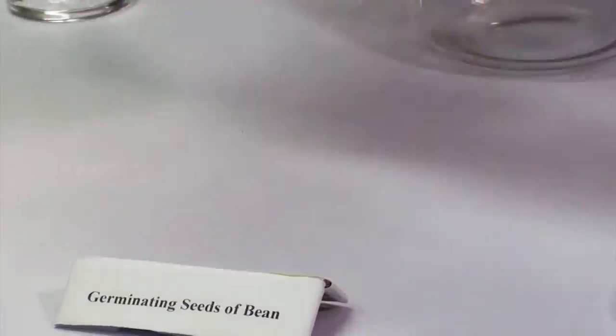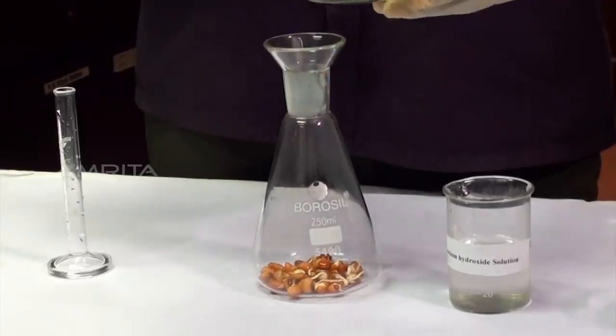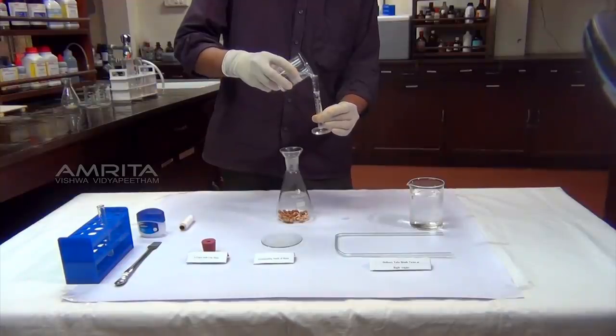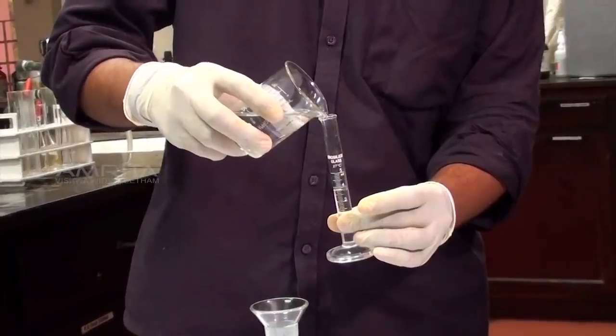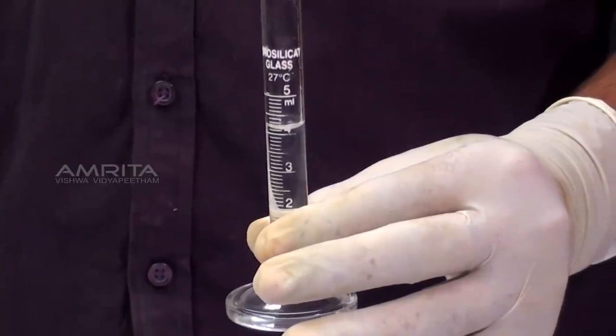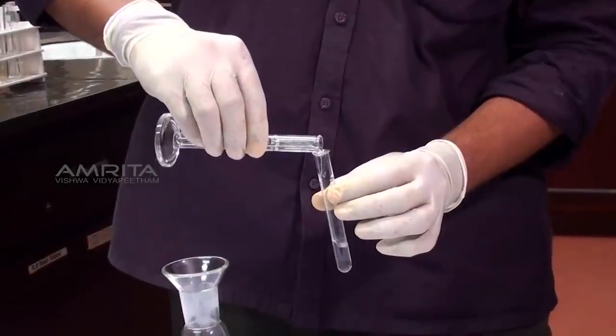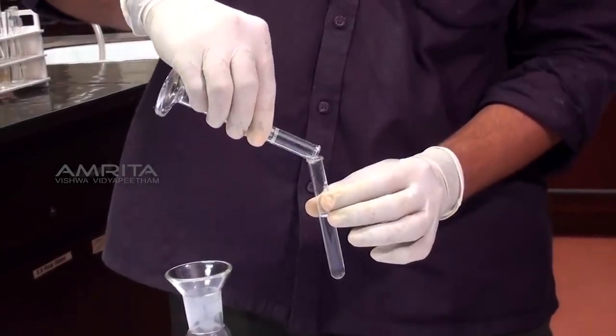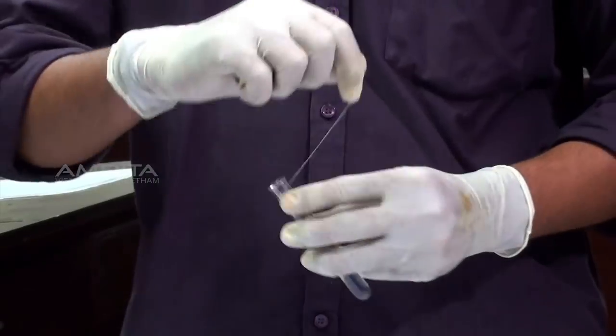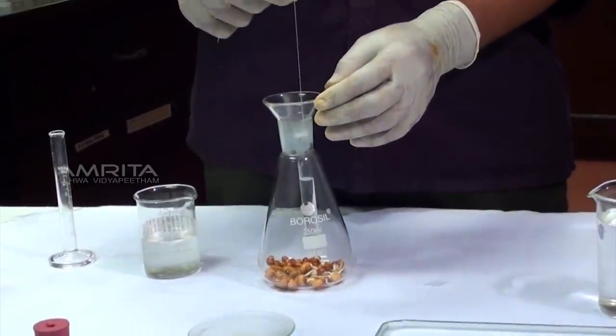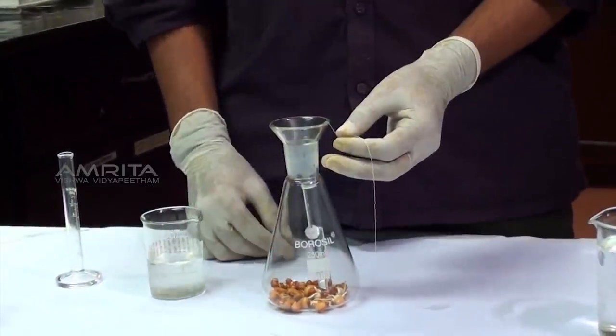Procedure: Using a spatula, place about 30 germinating bean seeds in a conical flask. Pour 4 ml of potassium hydroxide solution into a measuring cylinder. Transfer the potassium hydroxide solution from the measuring cylinder into a small test tube. Tie a cotton thread around the neck of the test tube. Suspend the test tube in the conical flask above the germinating seeds.